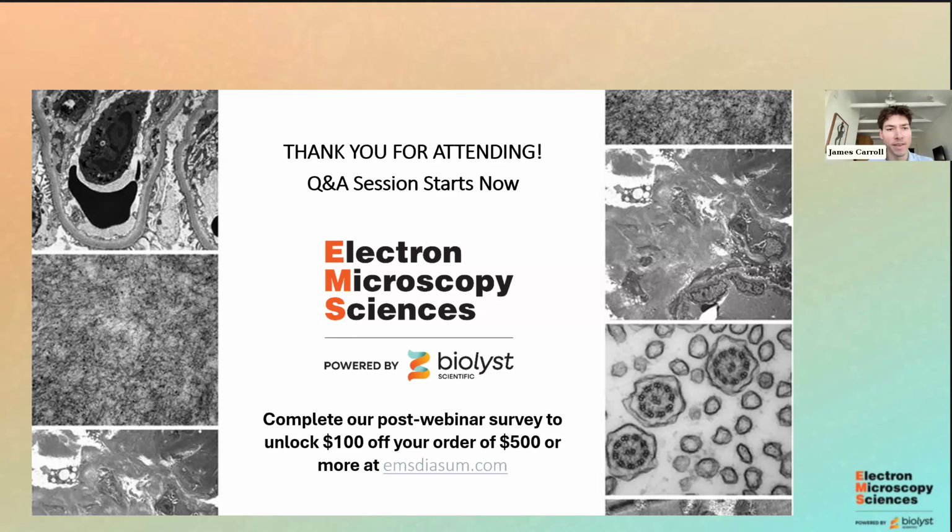Thanks, Rob. But yeah, we used to do that on all our muscle samples, and then we started looking, and I'm not really seeing a huge difference to justify adding that step, because it was kind of tedious weighing out pre-measured, very small amounts of all that. But we do still use it on some occasions.